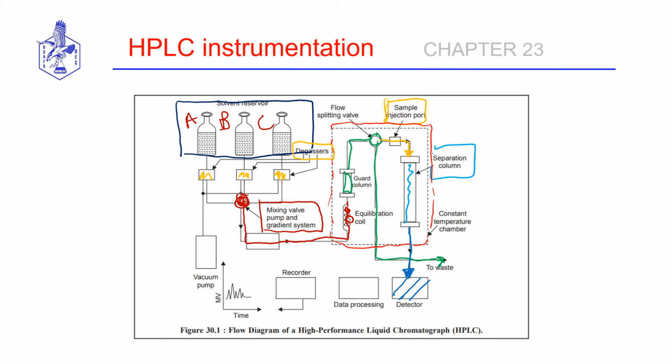Or something as sophisticated as a mass spectrometer. Okay, price just went way up. Obviously, everything is under computer control, including the proportional mixture of the mobile phase, etc. We record our data and we store it. I forgot to mention back up here, vacuum pumps that are used to drive our pumping system.